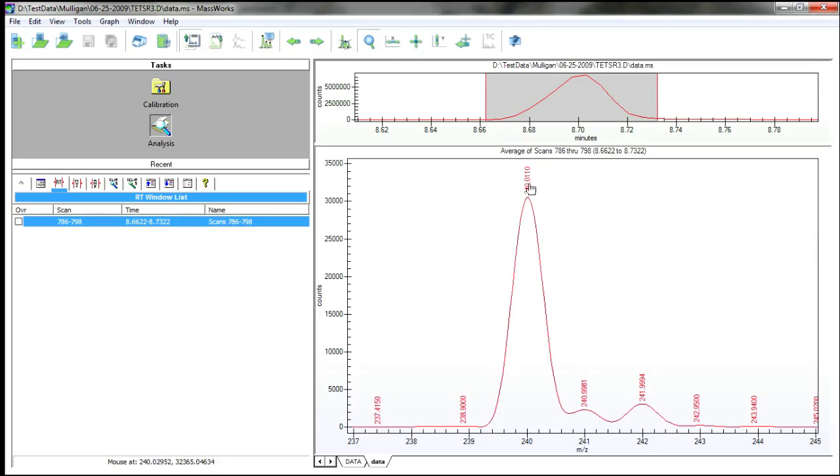While it is nice to determine the accurate mass location for this unknown ion using just a conventional GC-MS system, it would be even better if we could get its formula, or elemental composition, to see how many carbon, hydrogen, nitrogen, oxygen, etc. may be involved. This is a capability typically reserved for the more expensive, higher resolution MS systems, but is now available to single or triple quad MS users, thanks to the special PFTBA calibration and the high mass spectral accuracy achievable on these systems.